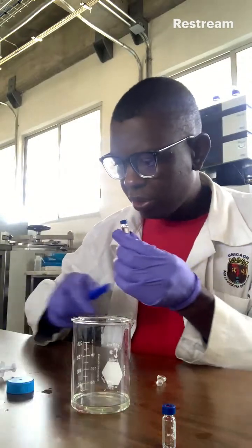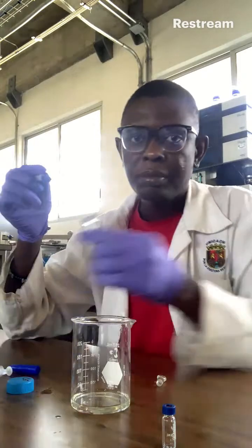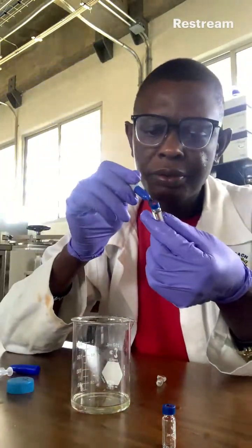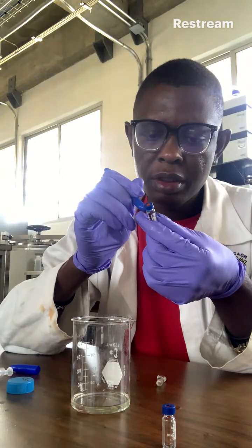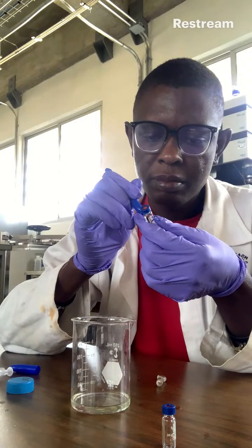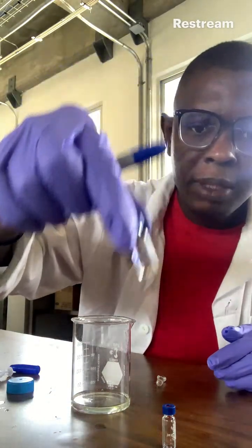So I'm going to label it also GC agave. Remember, anytime you're doing it, it's essential you label for clarification. So I have labeled my sample too.